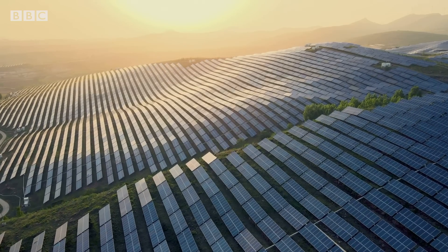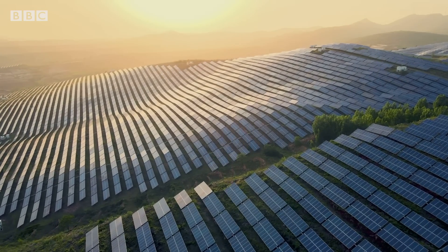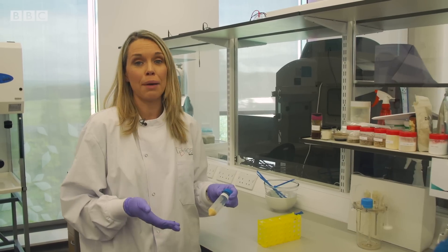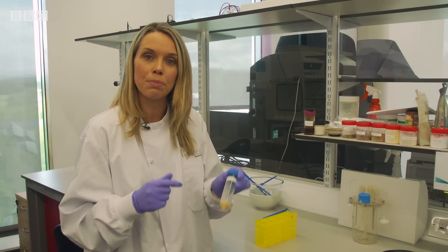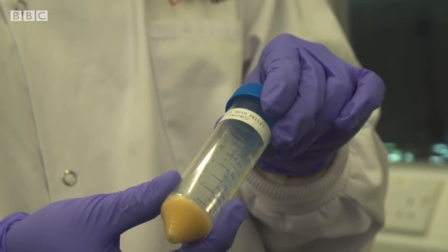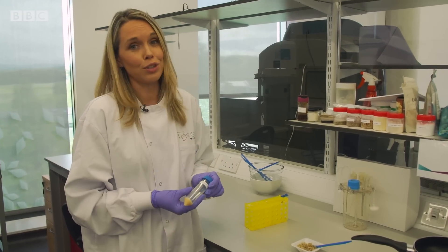And if renewable energy is used to power those bioreactors, it could be a greener way to generate meat. We've come to a part of the lab that you might not expect — we're in the kitchen. Those little flecks that you saw spinning around in the bioreactor have been harvested, and they now look like this. Eleanor's going to combine them with some other ingredients, and we're going to cook a sausage.